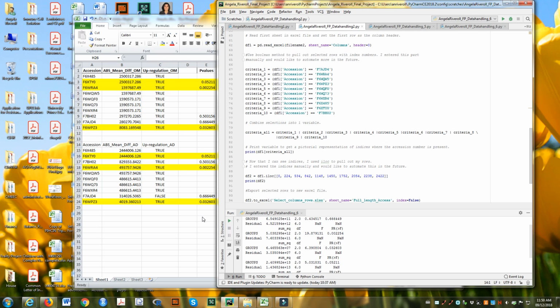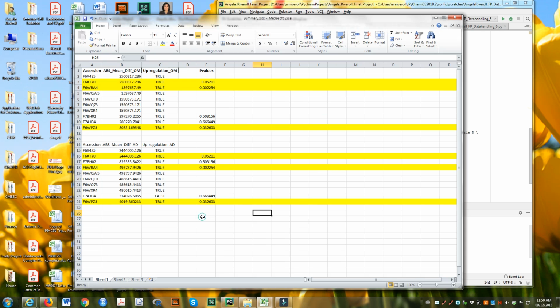And the other thing that will be interesting is at the moment I'm using boxplot to look at the data, but in the future, when I end up with thousands of these accession numbers where I see that I have a significant difference, I'd like to start grouping these by systems biology function, and then be able to display in some way whole systems being upregulated or downregulated in response to a cell determining its cell fate.